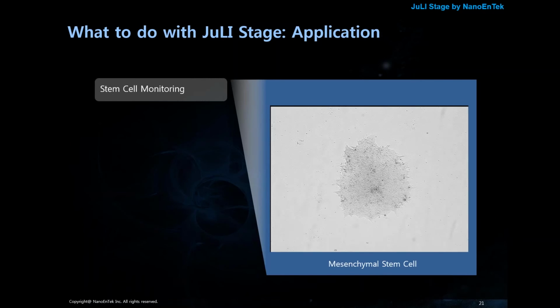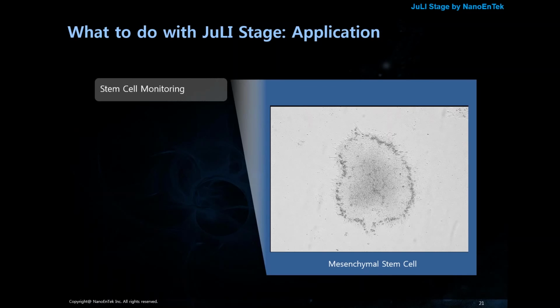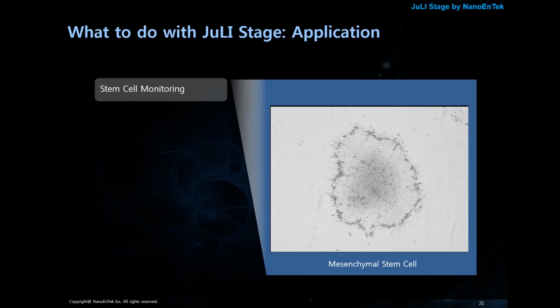And this slide revealed the results from a cell monitoring stem cell culture. Mesenchymal stem cells were transfected with a targeted DNA. After the induction, neuronal differentiation and cell growth images were captured for over 144 hours. This experiment was performed in collaboration with the Cha Hospital.